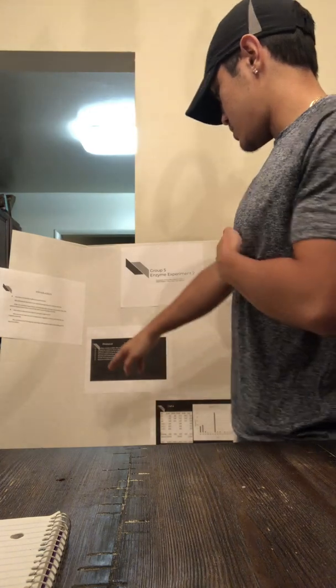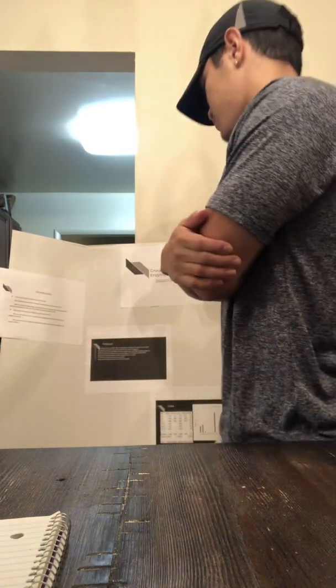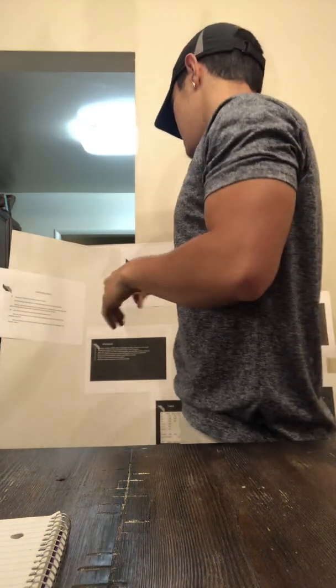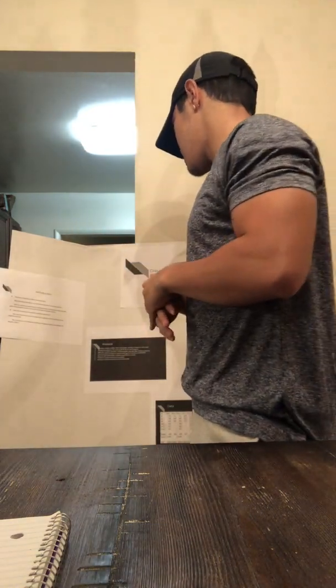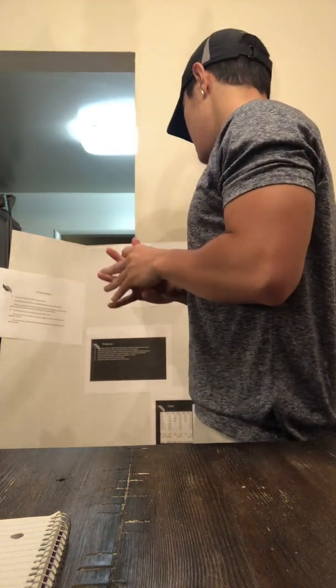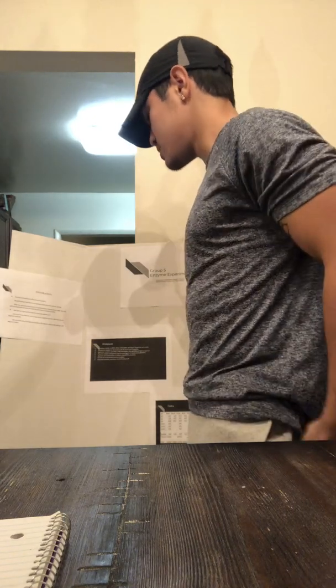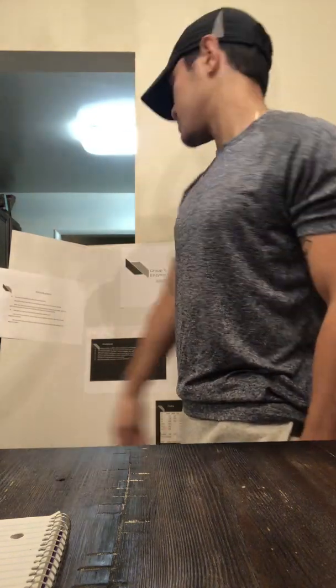Alright, so the first thing we did was add 450 microliters of buffer at pH 8. We chose pH 8 because that is what is usually found inside of an organism. Next, we used 500 microliters of azocasein. Azocasein is what reacts with the trypsin, which we used 50 microliters of. And we did this for each sample with 3 replicates.